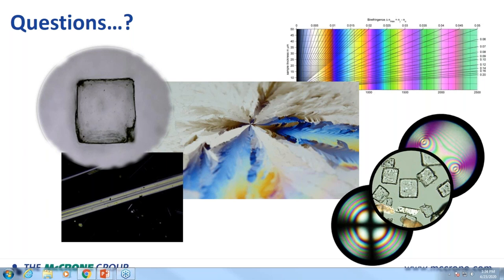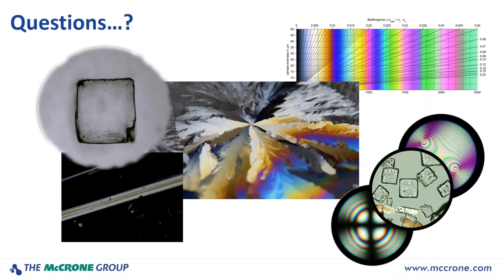All the images you saw here, I think, except the interference figures, I actually took at home in my basement this week using a pole scope and a very simple digital camera, a Luminera camera, not the high-end scopes we have here in our labs. Yeah, I think the key there, Tom, is the manual setting of the camera to bypass all the automation, especially as you try to throw different conditions at the camera.